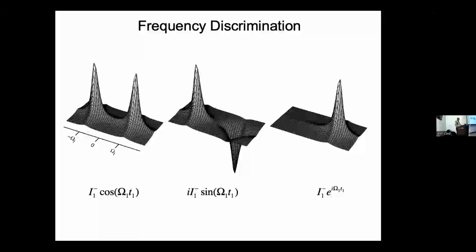you have to make sure all of your frequencies are either positive or negative, which means you have to take a trial spectrum with the RF carrier on one side or the other of the spectrum, right? Normally you put the carrier in the middle and then you have to know which side is positive and which side is negative.